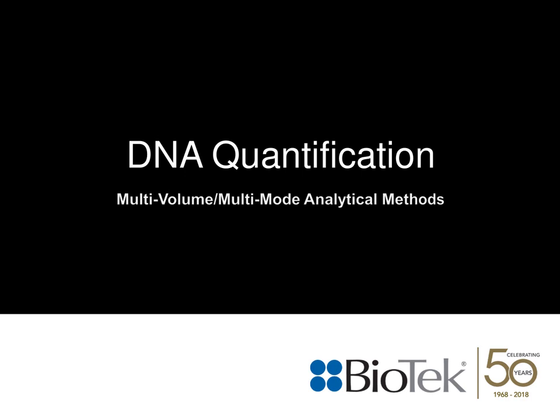Great, thank you. Hello and welcome. I want to thank you all for attending the presentation this afternoon. Today, I'd like to discuss methods that will help increase throughput and efficiency when quantifying biomolecules in conjunction with microplate instrumentation. In particular, I'd like to focus on quantification of DNA using a variety of sample and reagent volumes, as well as a range of analytical methods requiring various detection modes.